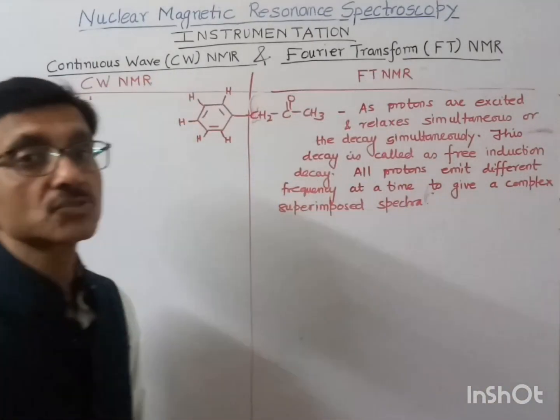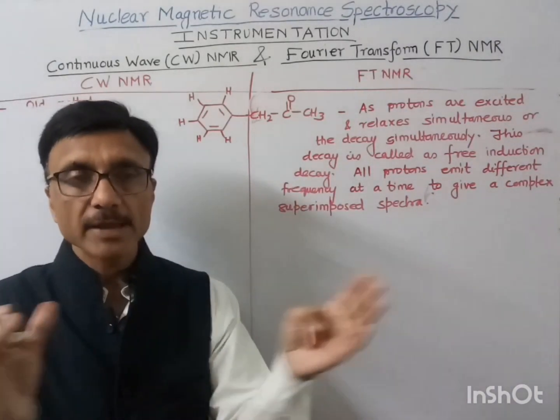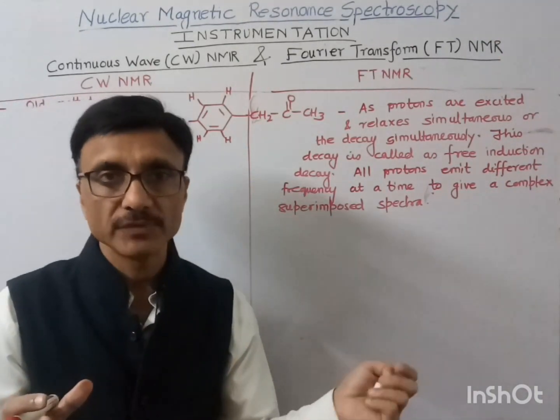Why? Because all 3 frequencies are emitted simultaneously, and that's why they superimpose with each other.